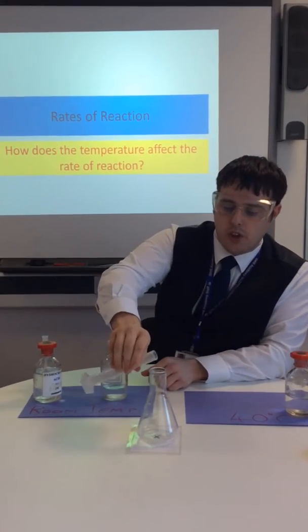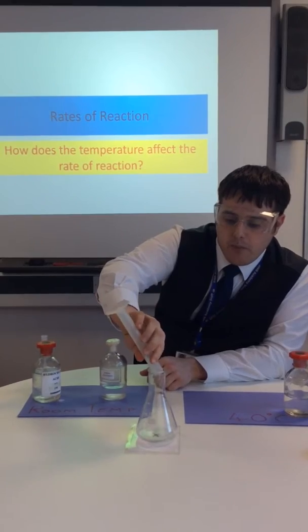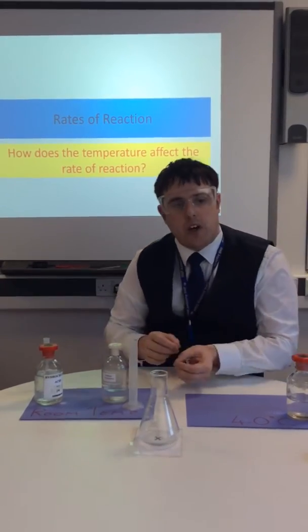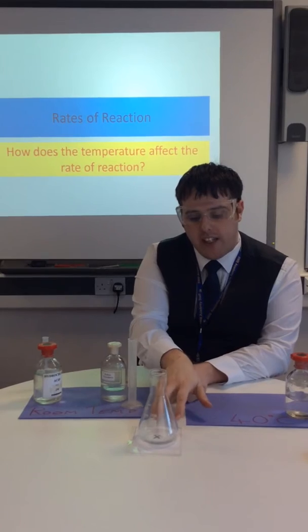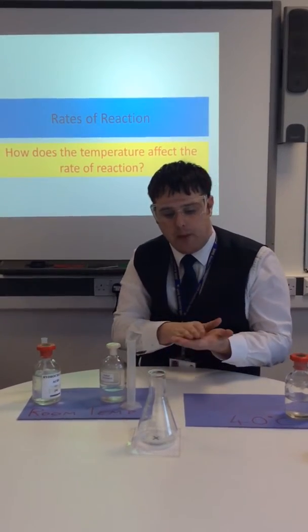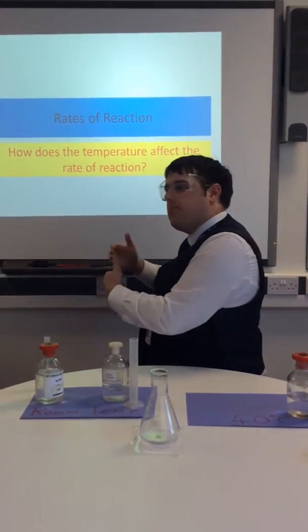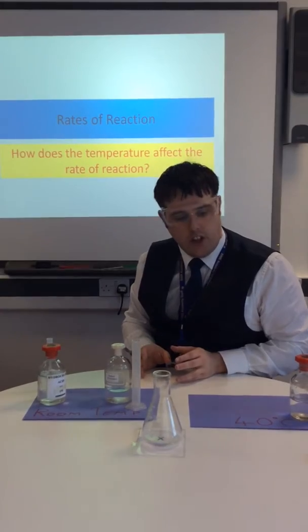And that just goes straight in there. Now, I'm not going to pour this next one straight in, because what I'm trying to do is time how long it takes before that solution goes cloudy and it becomes impossible to see the X. So that's how we're measuring our rate, or our speed, at which this reaction is occurring.